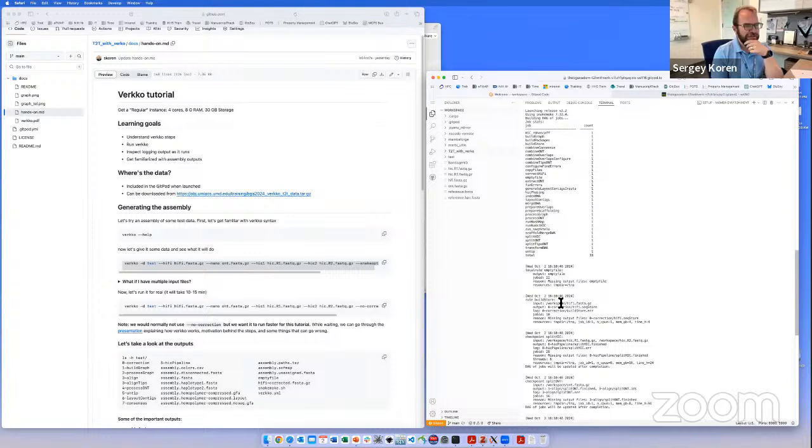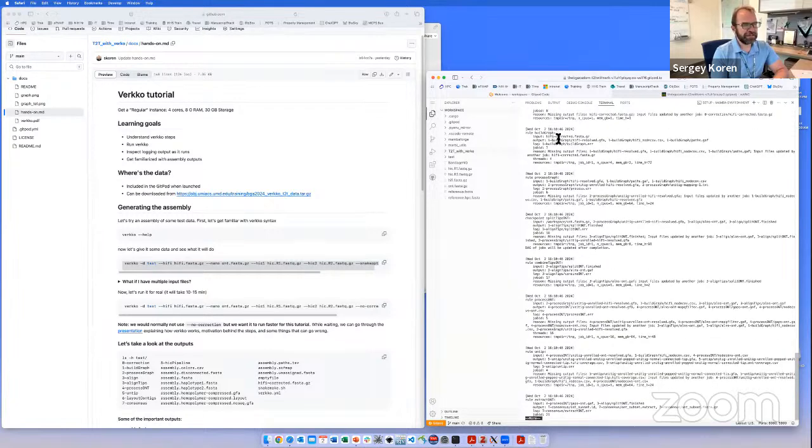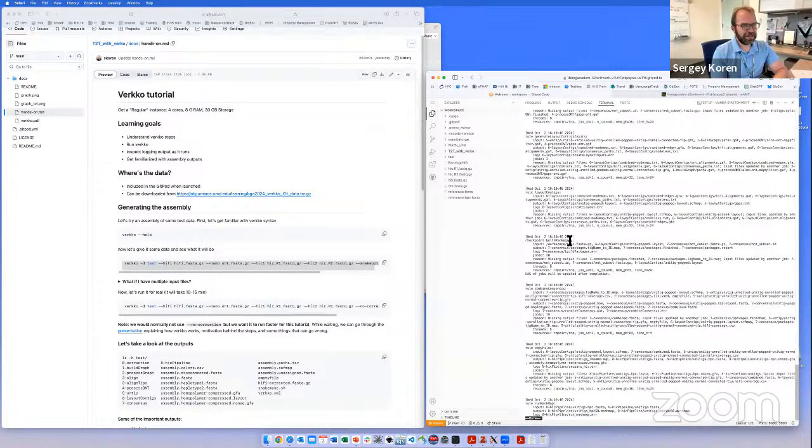If you go through these steps, the rules somewhat explain what it's going to do. So it processes the HiFi FASTA first. It partitions your Hi-C data and your ONT data into smaller batches. It builds the graph for the assembly. So this is the multiplex de Bruijn graph that it builds from the HiFi data, simplifies that graph, processes the ONT data. There's alignment steps in between here where it's aligning and combining the ONT data, simplifies that graph after the ONT data, then removes bubbles. And then lastly, it generates the consensus. So here it's generating the final sequences.